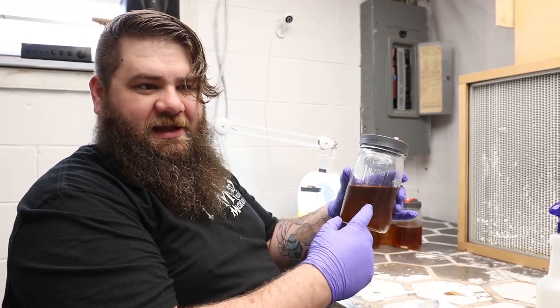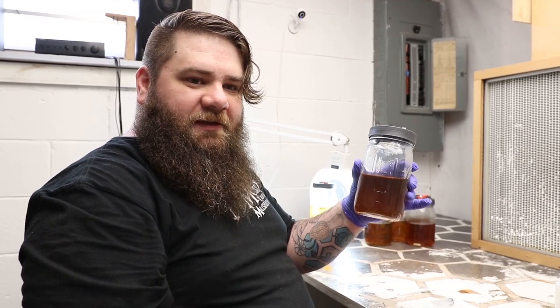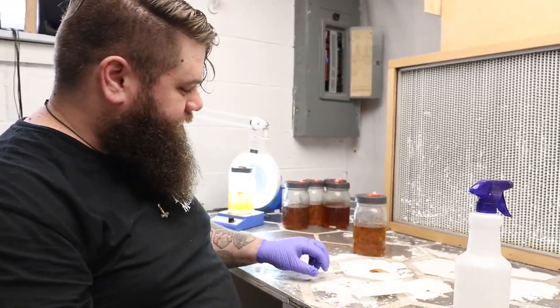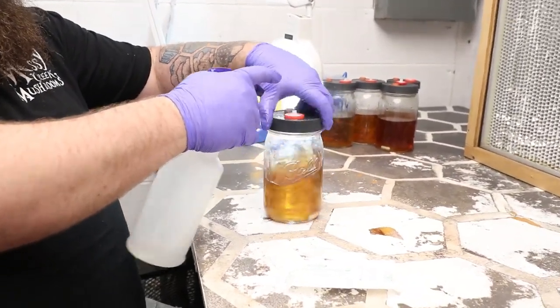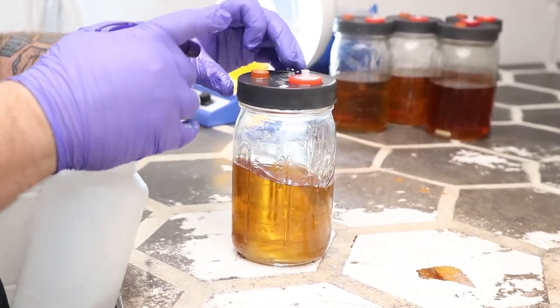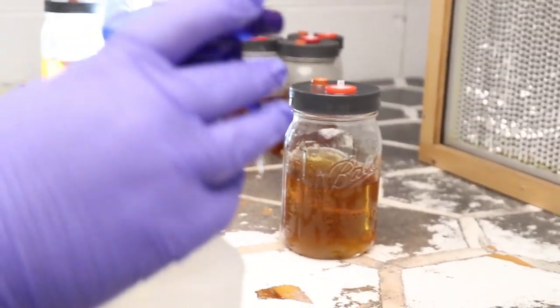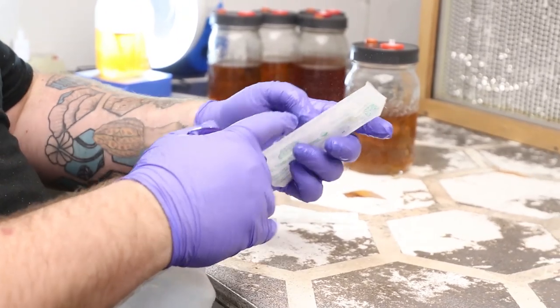Once you take that, I just cook it in a pressure cooker for about 30 minutes at 15 psi. Once it's nice and cool, bring it down to the lab.